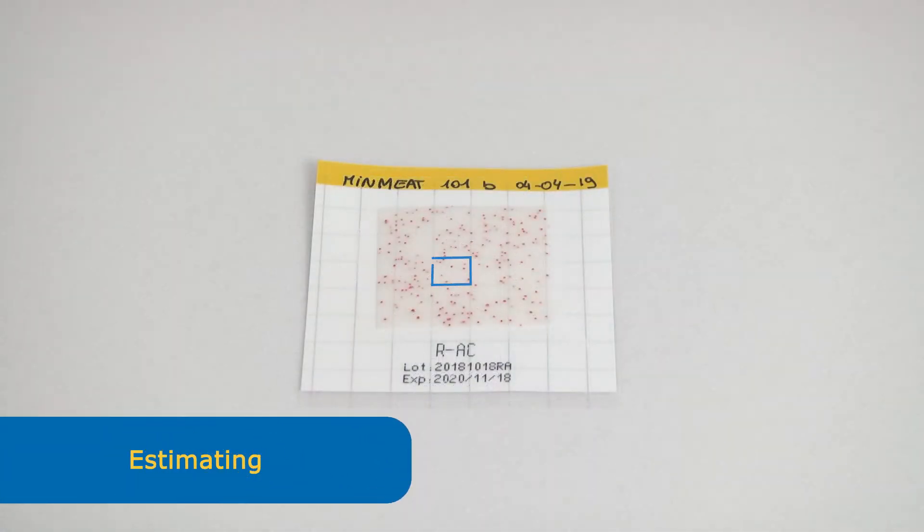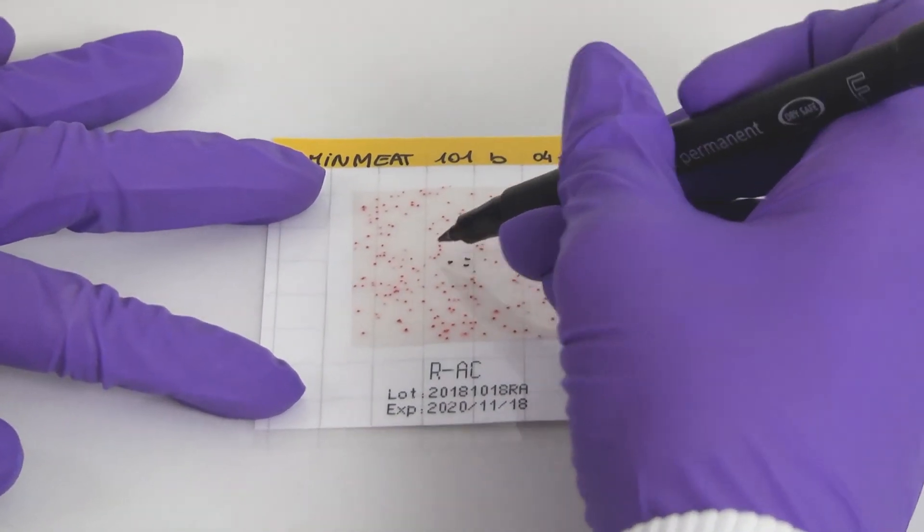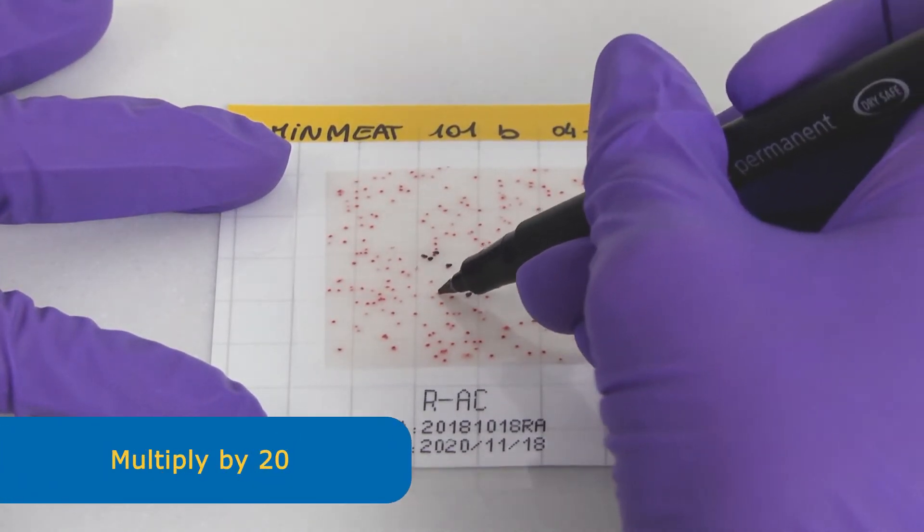If the large number of colonies makes it difficult to count, colony counts can be estimated by counting colonies in one grid square and multiplying by 20.